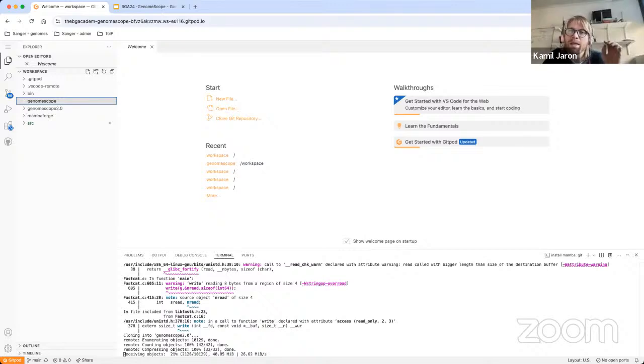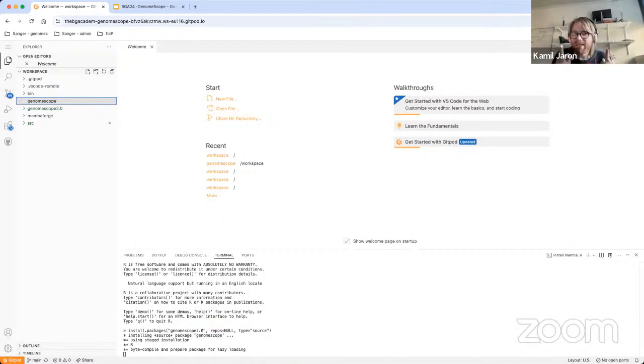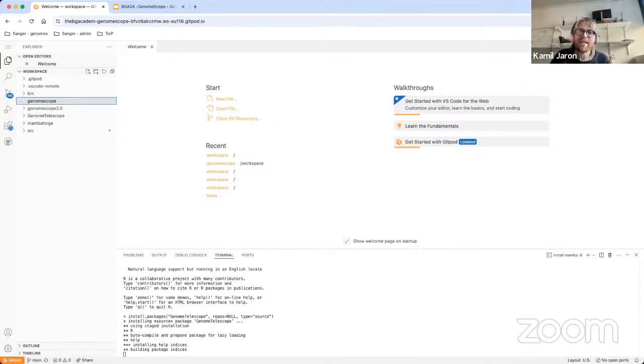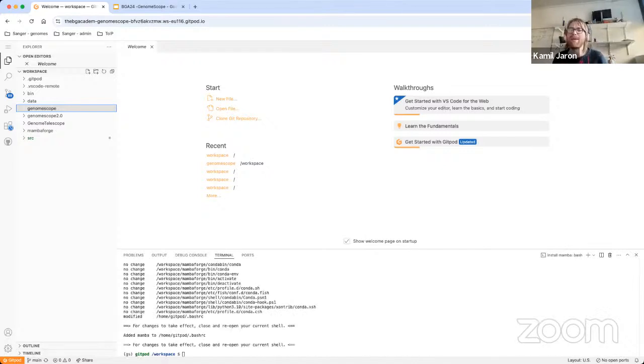Actually, it does matter a tiny bit if you really poke into this and do Kmer spectra of all the possible Ks and fit Genomescope models with all the possible Ks. In theory, it should cancel each other out, but you will get slightly different values, and it still needs to be properly understood why exactly that is. But I think these are biologically non-meaningful differences. So just don't overthink it. Go with 31. Don't sweat it.